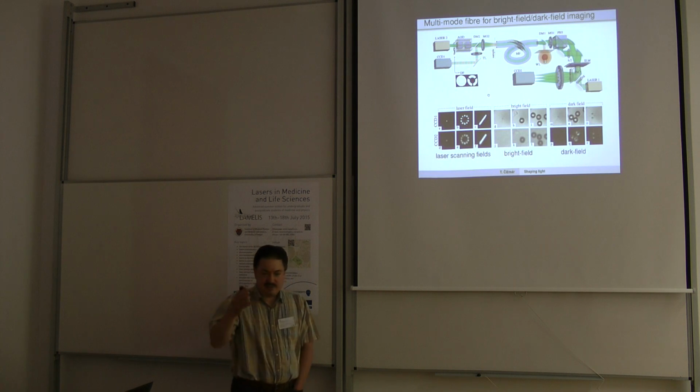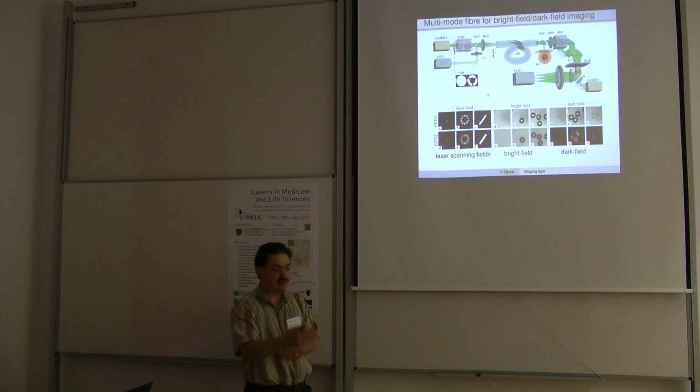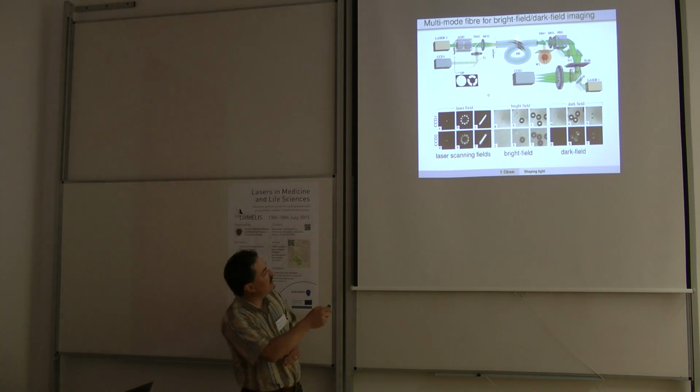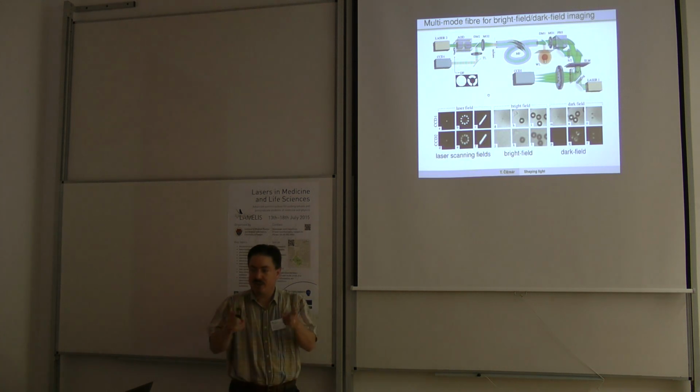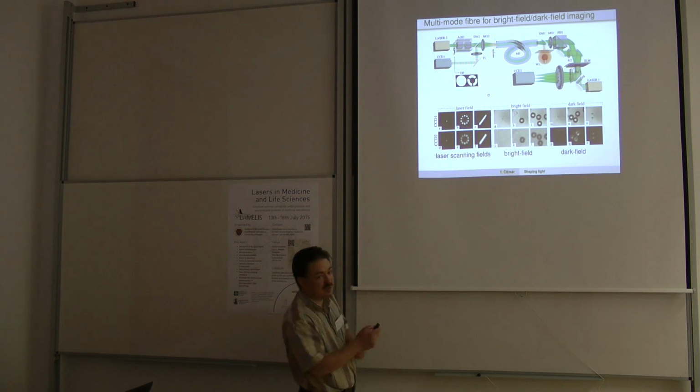What it does, the microscope objective will give you sort of a Fourier transform of the image. And the tube lens then efficiently inverts the Fourier transform, and it gives you a copy of the sample field on the CCD. Right? So you have a pair of Fourier transforms that sort of cancel each other. What we have on the right side is essentially the same thing.